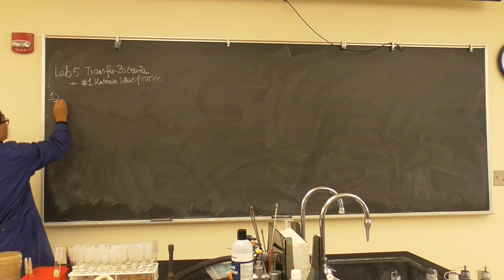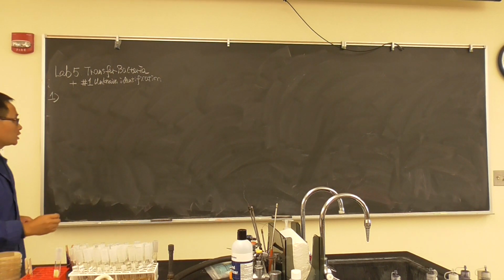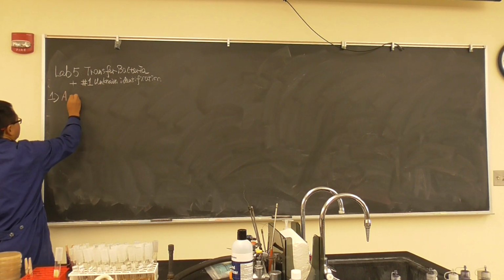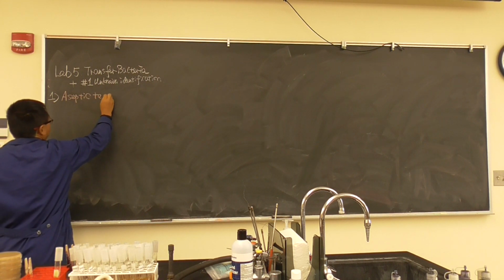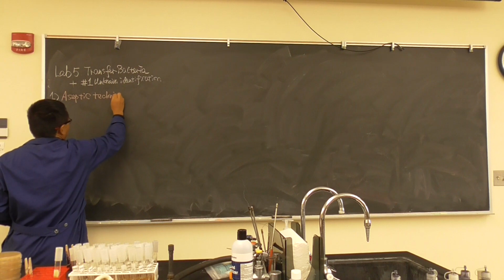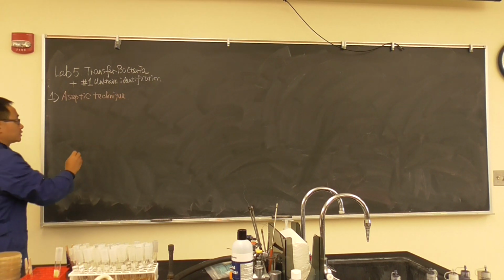First of all, we want to talk about transferring bacteria. We would love to introduce you to a concept called aseptic technique. What is aseptic technique?